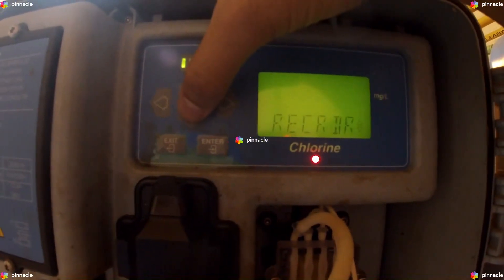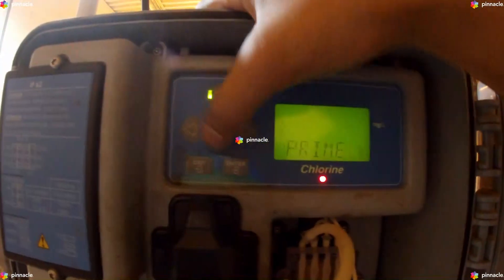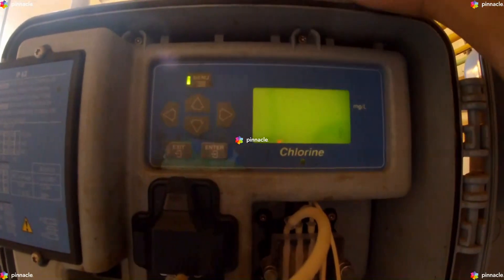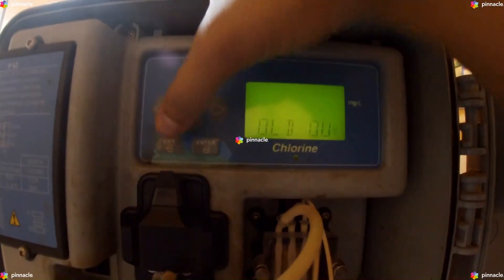Scroll down to Maintenance, Enter. Scroll to Hold Output, Enter. Scroll to Off, Enter. The red LED turns off.